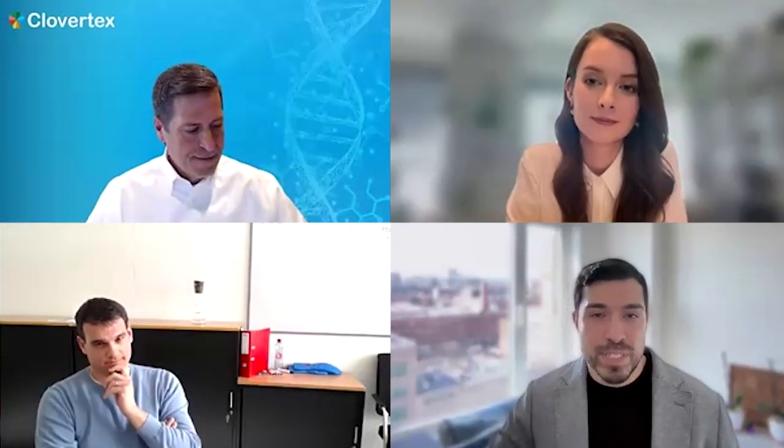So I think in terms of answering the first question, I can talk generally about structural biology. I think just the general difference between academia and industry. I think in academia, again, this dates me, I come from a generation of structural biologists where we were all trying to get the first in class structure. So seeing that protein complex for the first time. And so whether a crystal system or maybe even a cryo-EM system gave 3.5 angstrom resolution or 2 angstrom resolution, that was good enough to model it and publish a paper.